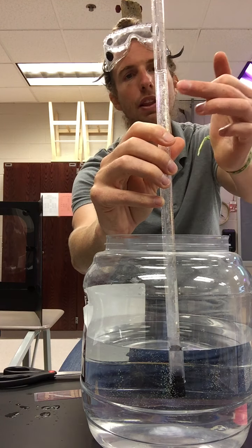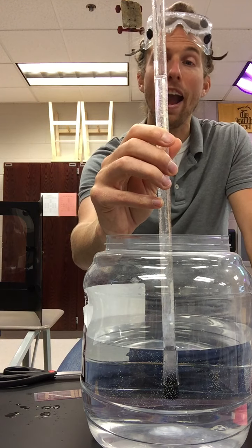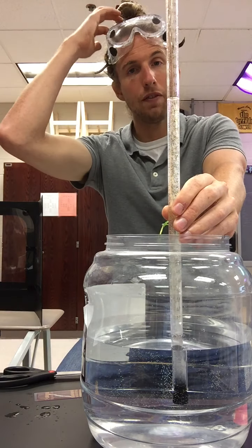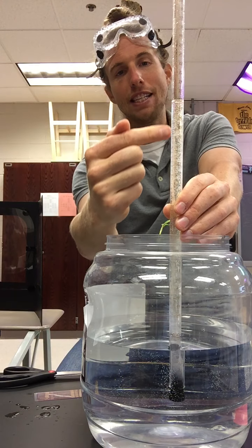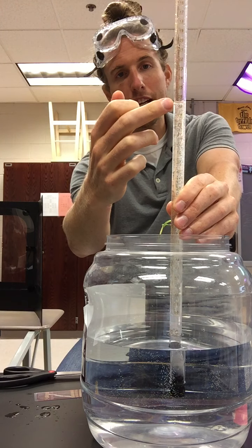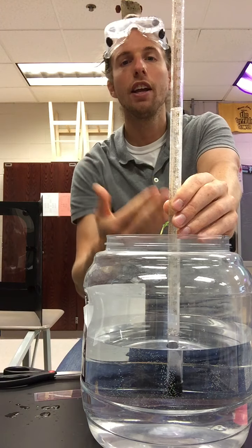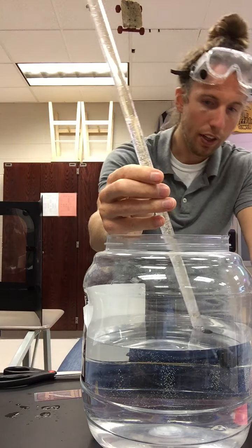One of the beautiful things about this eudiometer tube is that it's graduated. It has numbers on it. And even better, this eudiometer is graduated upside down, so 0 is up at the top. We have 0 milliliters of gas, but as this gas is forming, the meniscus is traveling down the tube, and the numbers actually increase. So right here, we just passed 26. It's approaching 27, 28. So as the gas goes this way, you can count the numbers as they increase with the amount of gas being released.